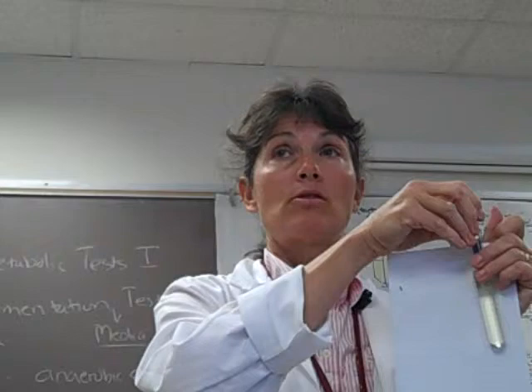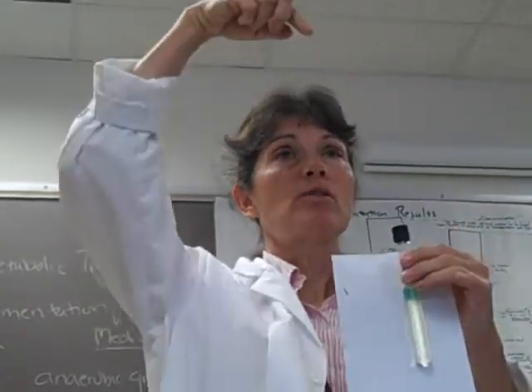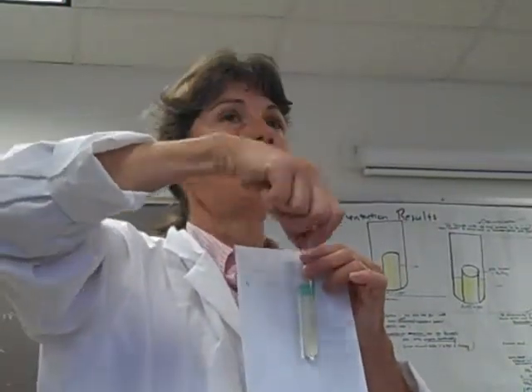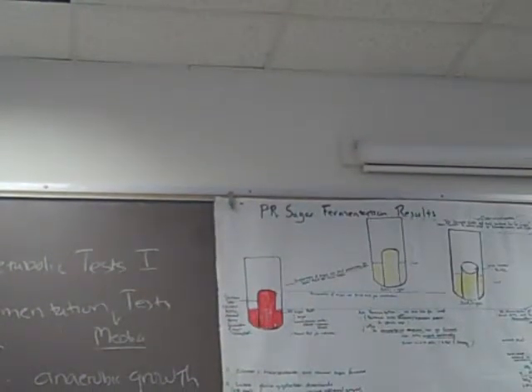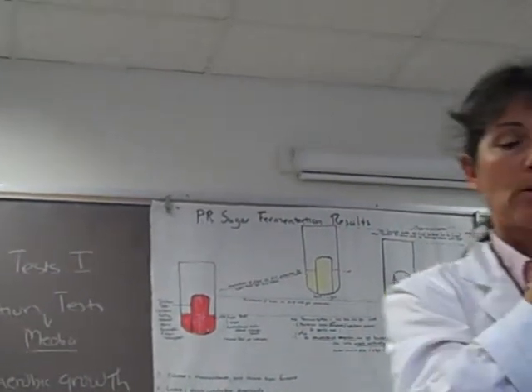When you inoculate the tubes, you can use your loops, but using good aseptic technique, you're going to go straight down and straight back up. You don't want to jiggle your loop like I showed you, because you don't want to introduce oxygen. As always with these screw cap tubes, you want to tighten them and then just barely loosen them so they can vent. Good labels are very important, you guys.